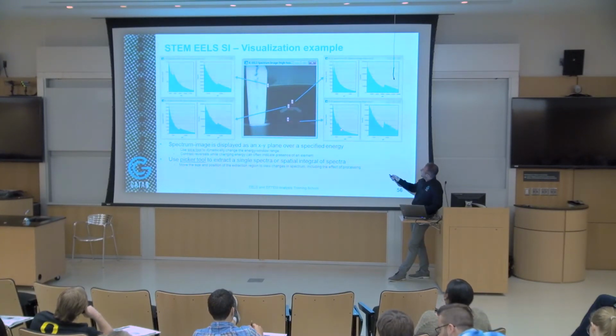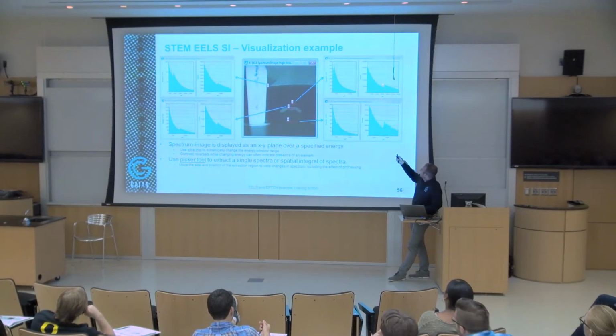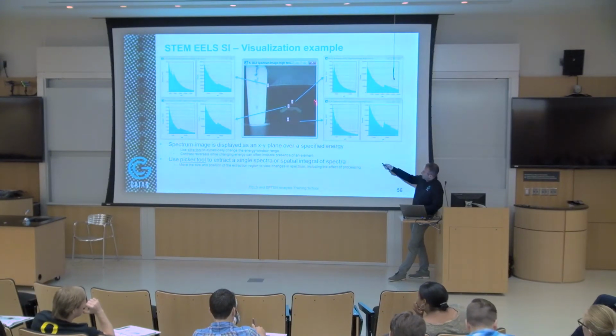You can see here we're getting oxygen. This is typical of silicon oxide. This might be something else. This should be the nitrogen edge, and then you're getting some sort of silicon nitride in there. And number 2. So essentially, you get an EELS spectrum point by point. Okay, you can move around and extract spectra from different regions of this data cube here.